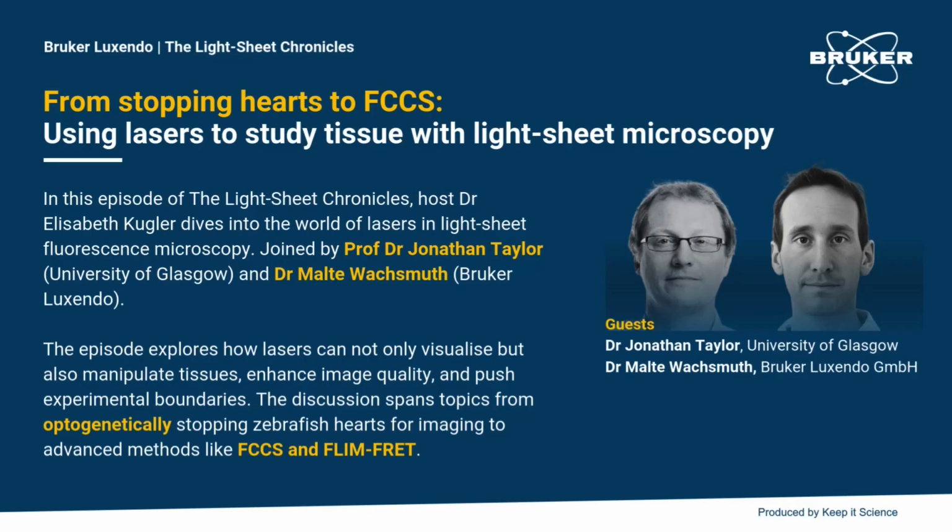The FCCS stands for fluorescence cross-correlation spectroscopy. And maybe let's step back a little bit and start with FCS, which is fluorescence correlation spectroscopy. That's a method that has been termed an emerging method since 1970 or 1972, but it's really coming of age finally. Not least because it's being used on the platform of light-sheet and also TIRF systems, so camera-based systems basically.